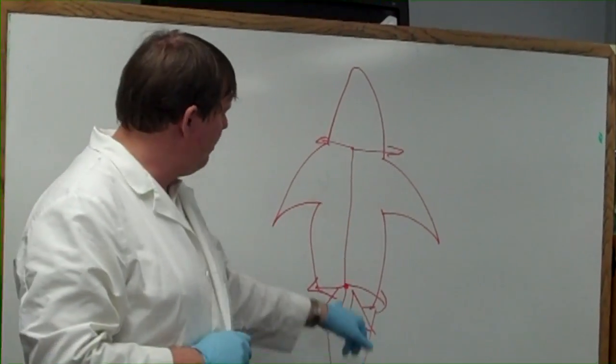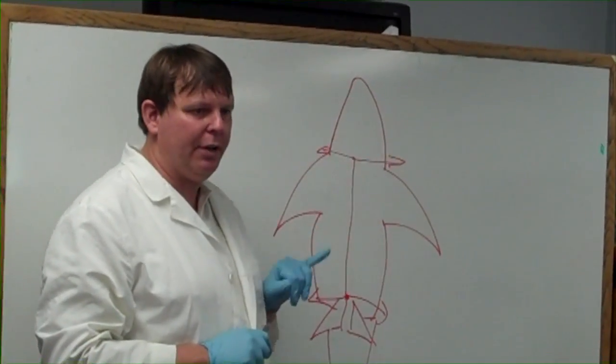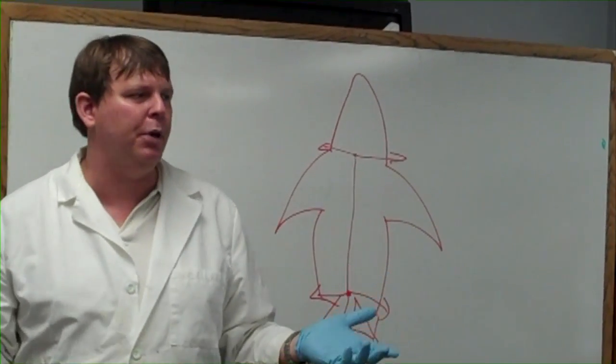In order to get into that, you're going to make an incision down here, cut up to just above where the pectoral fins are. Cut across this way, cut across this way, and it will open up like a book.